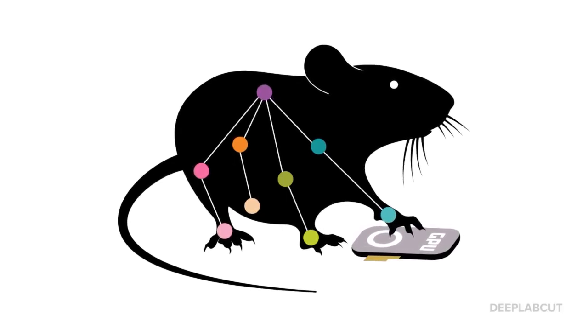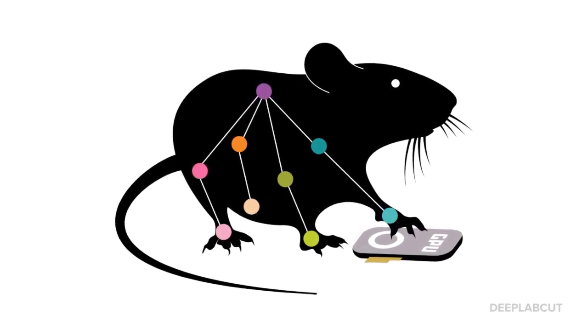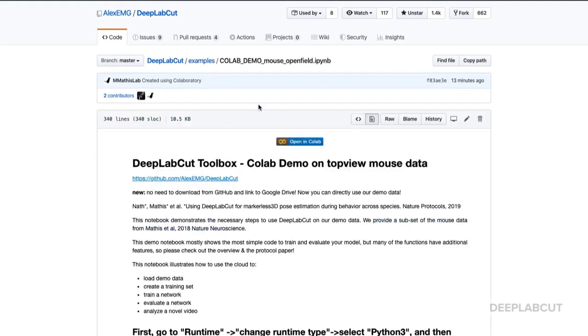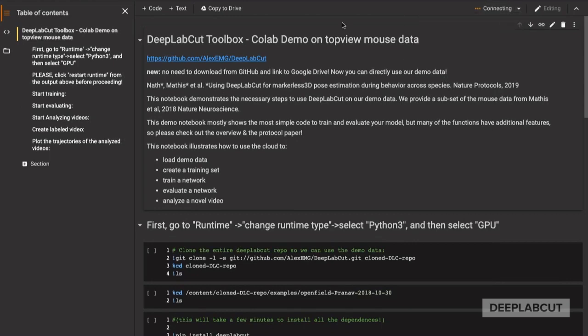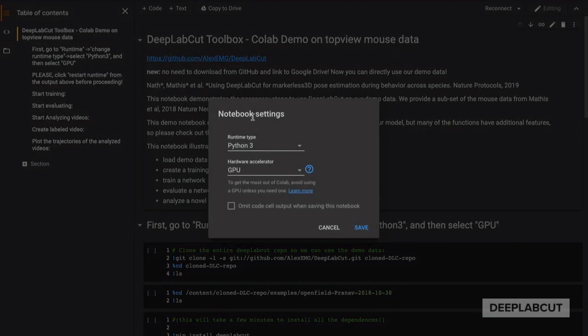Welcome to the latest DeepLabCut demo for Google Colaboratory. You can find the notebooks on our DeepLabCut repository under the folder Examples. Click on the blue icon to launch the repository on Google Colab. You'll want to connect to a hosted runtime and make sure that you have GPU access.